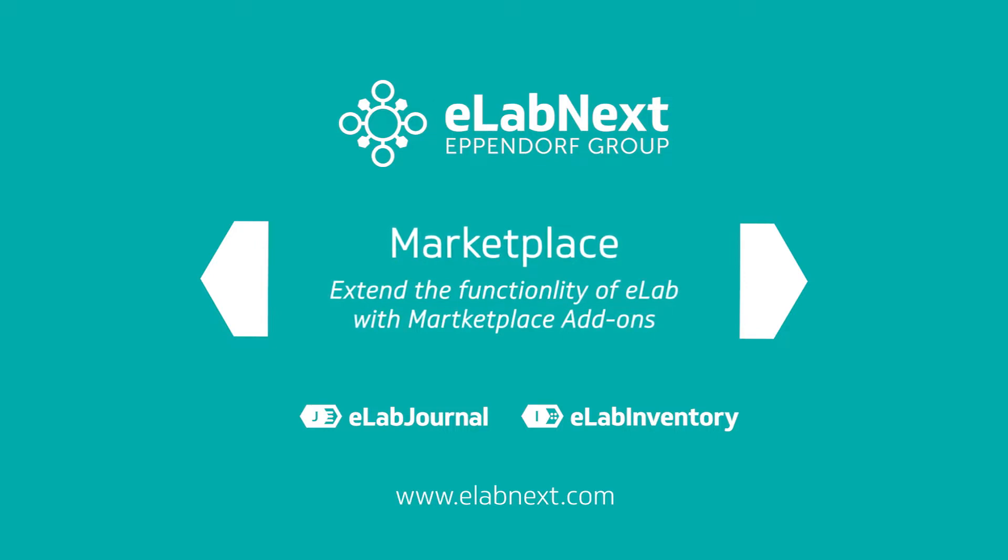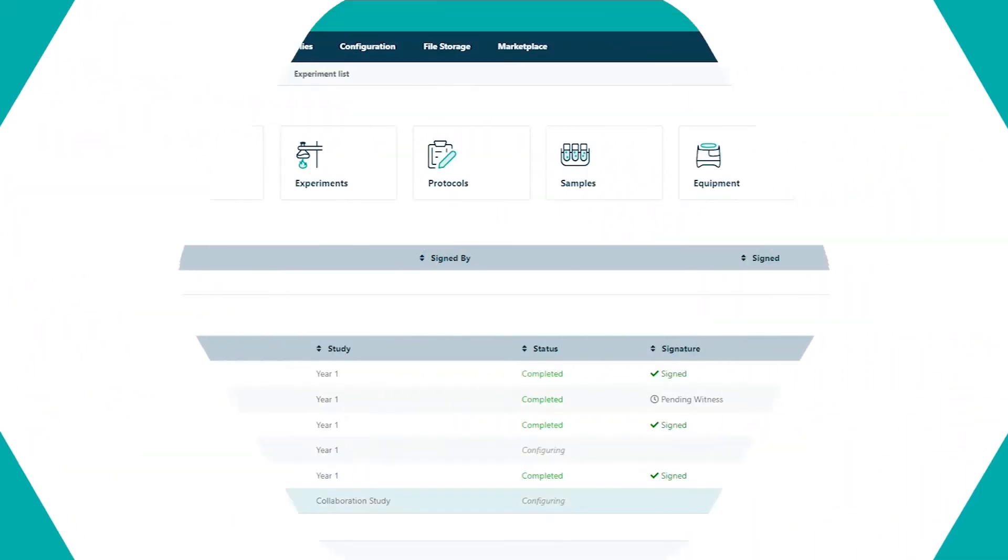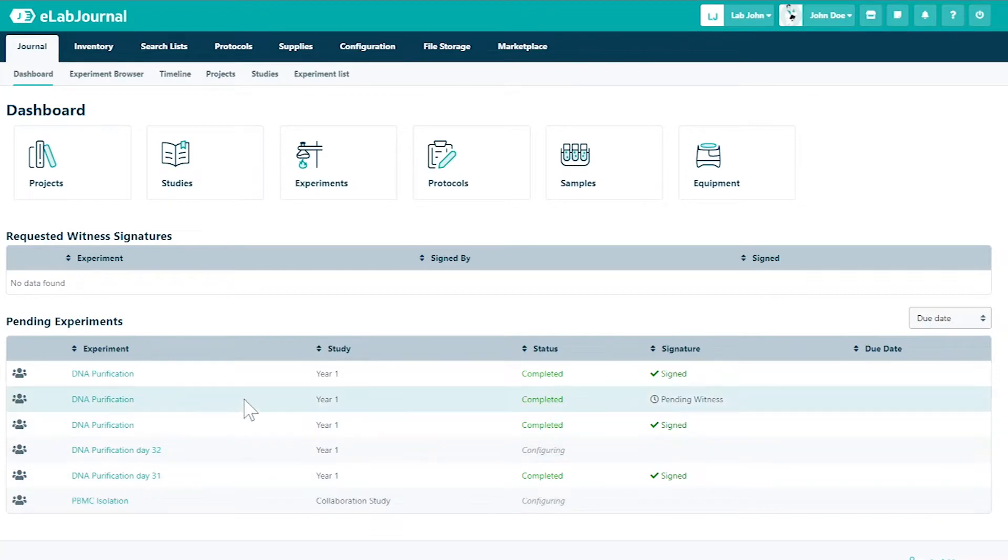In this video, you'll be learning how to extend functionality with add-ons from eLab Marketplace.